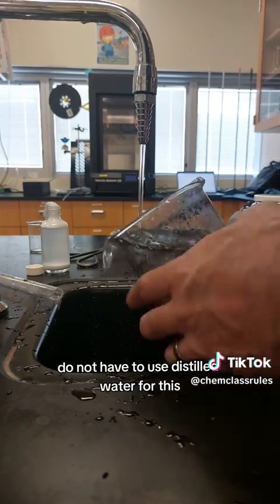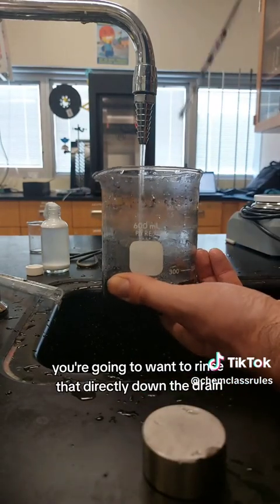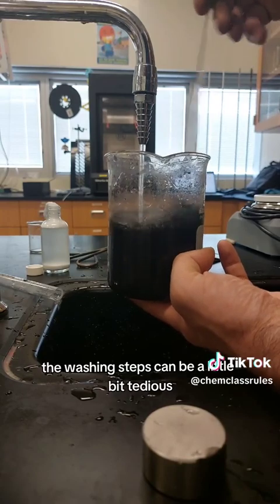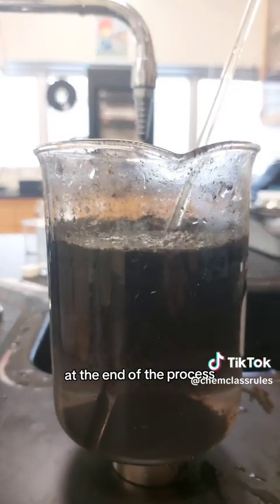You do not have to use distilled water for this. There's going to be a good amount of scum that comes to the top — a little unused ammonium oleate — and you're going to want to rinse that directly down the drain. The washing steps can be a little tedious, but they're very important if you want a good ferrofluid product. My students and I have found that the more times you wash it, the quicker the separation becomes.